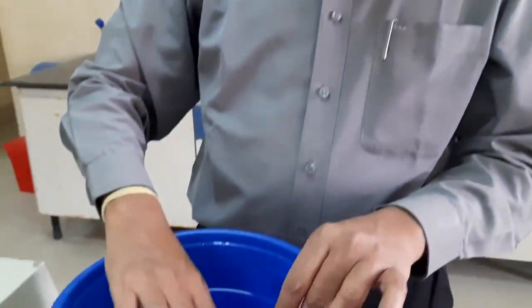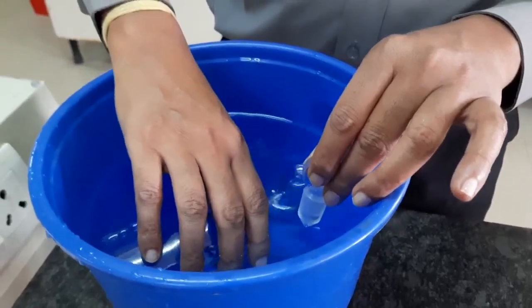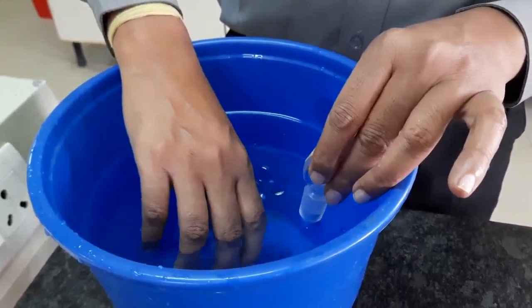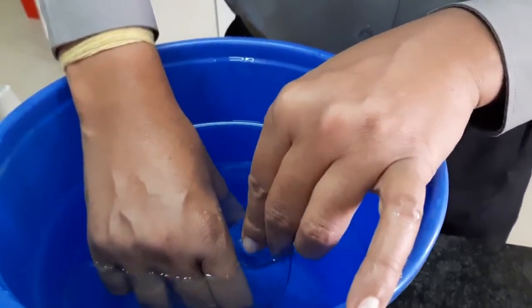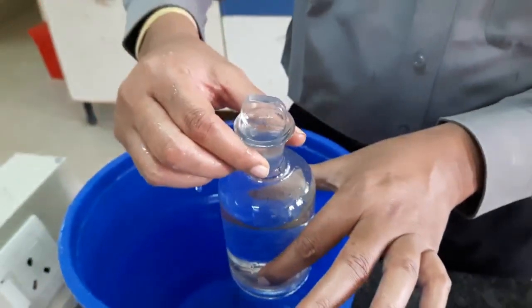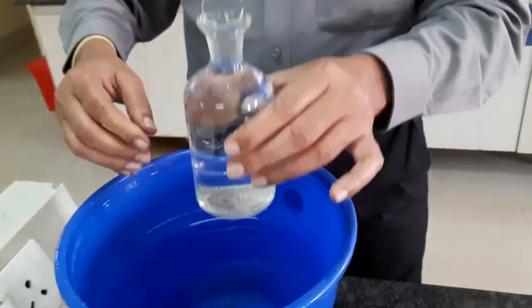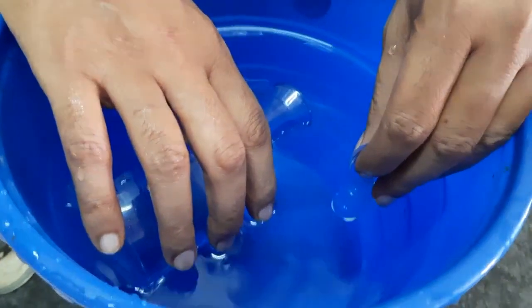Let us now try to know how the water sample is collected. The whole BOD bottle has to be submerged in the water, and you have to ensure that there are no air bubbles. Then the stopper has to be placed in the water itself, to see that there are no external air bubbles within that, and there will be water near the stopper, which is permitted. That's it. This is the way water has to be collected.